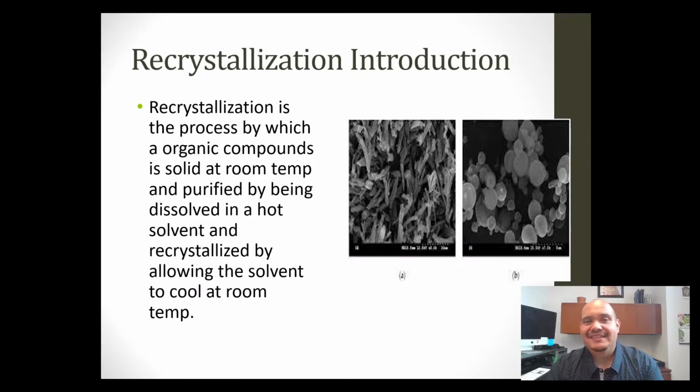Introduction. Recrystallization is the process by which you take a solid solute and dissolve it, or solubilize it, in a particular solvent. The solute is thereby purified, and then it is crystallized again into a new crystal that is of the same chemical makeup as it originally was. This is important for us to remember.